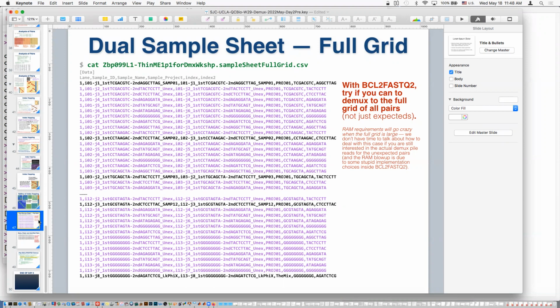So yeah, there are cases you can get away with it, but in general, I don't recommend running a Demux job in pieces. If you do, keep the set of cycles that are being paid attention to exactly the same. Don't use that as a way to handle mixed index formats. And keep your Demux tolerance the same.